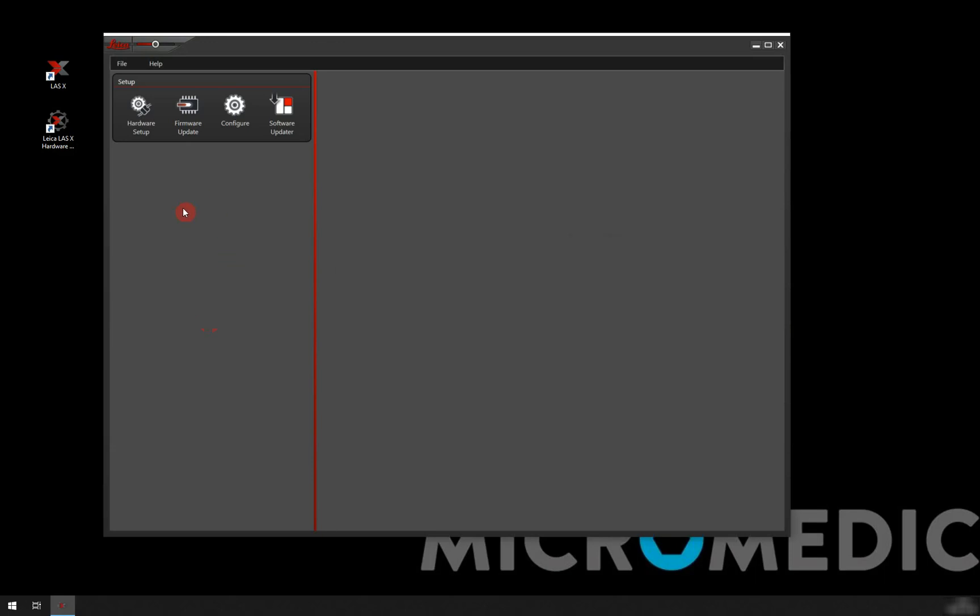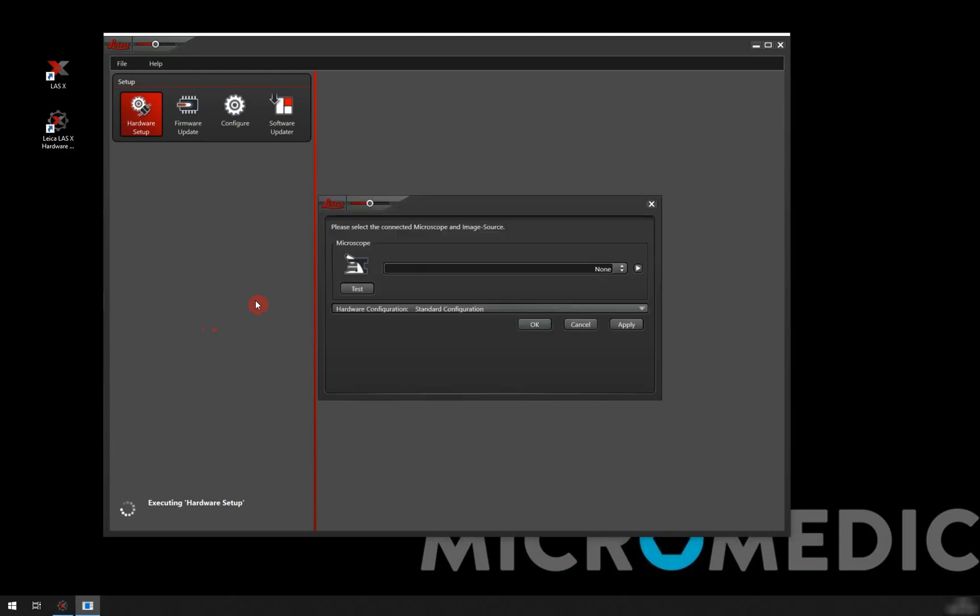Once in here we're going to start by going into the hardware setup. This is where we tell the software what type of microscope we have, which model.